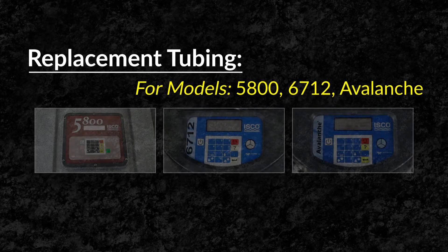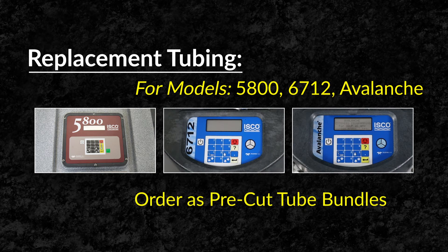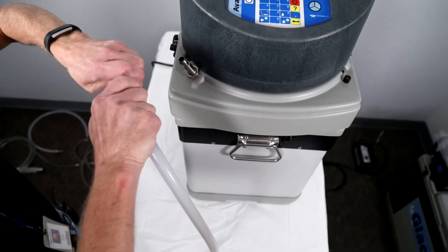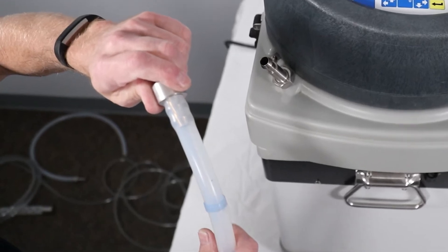Replacement tubing for models 5800, 6712, and Avalanche come in packages of pre-cut tube bundles. Install the tubing coupler into the new pump tubing on the end that is closest to the blue bands.